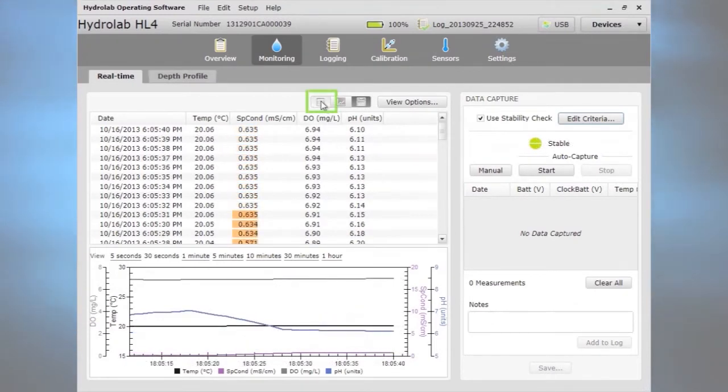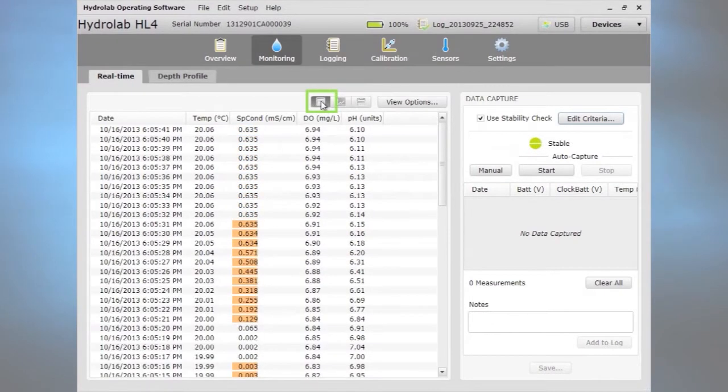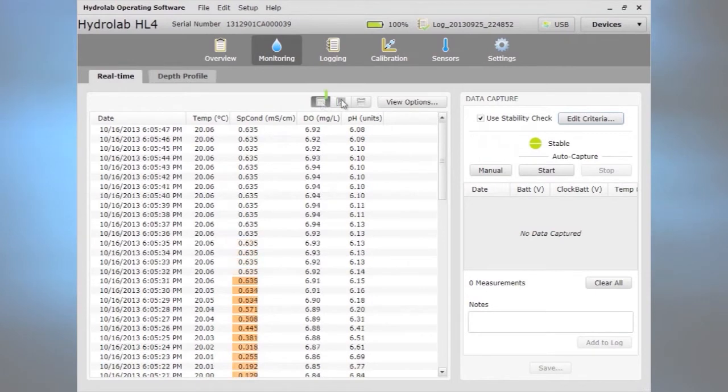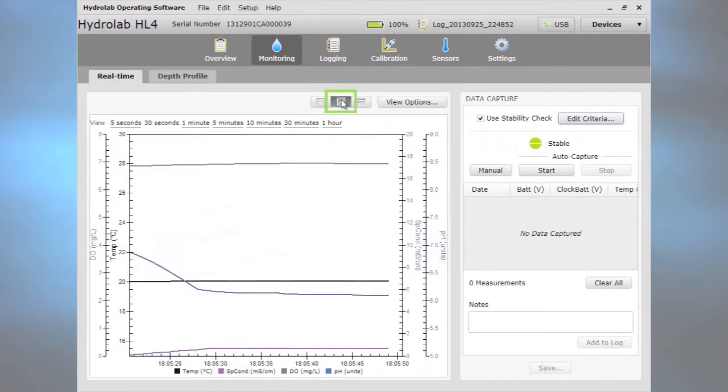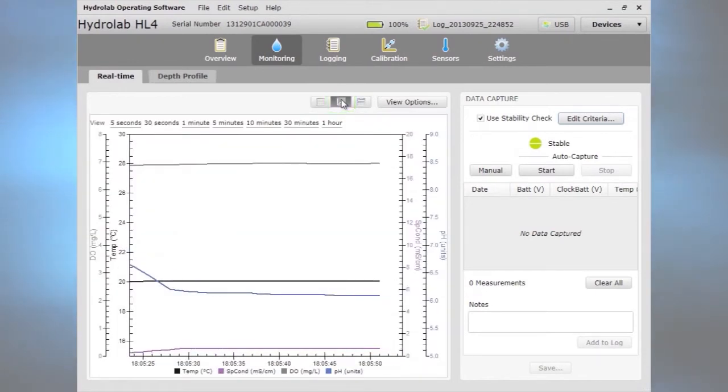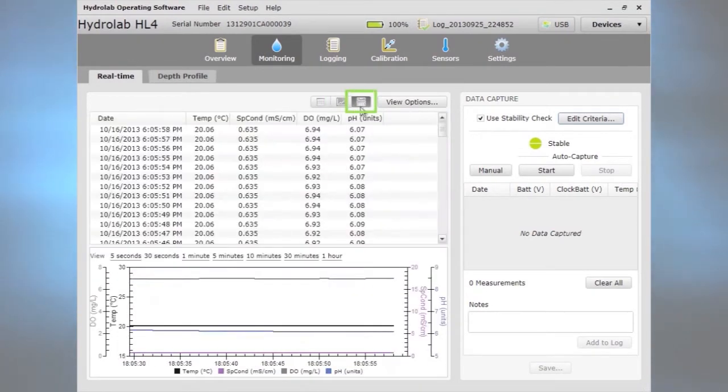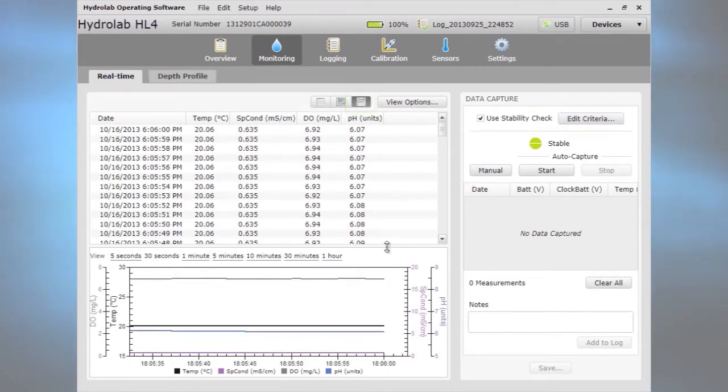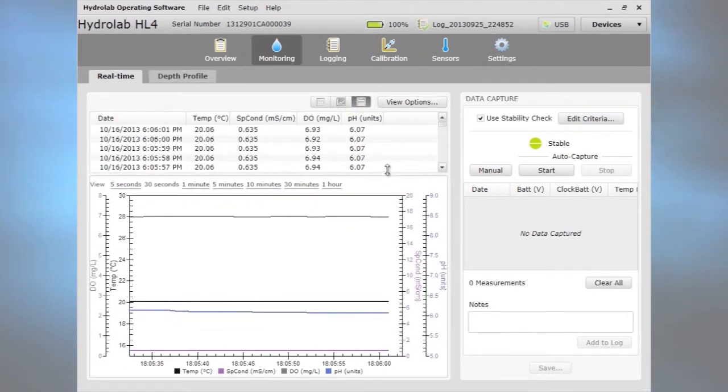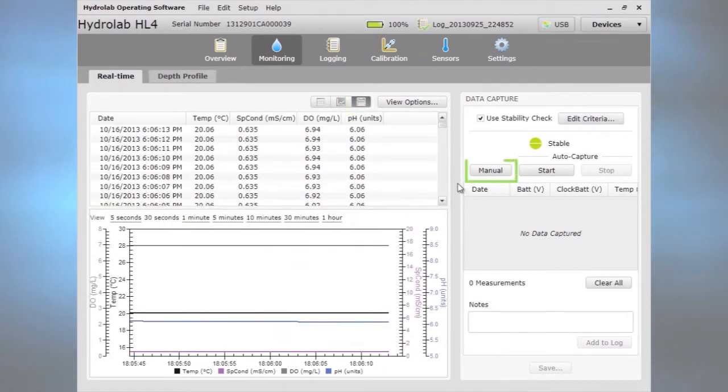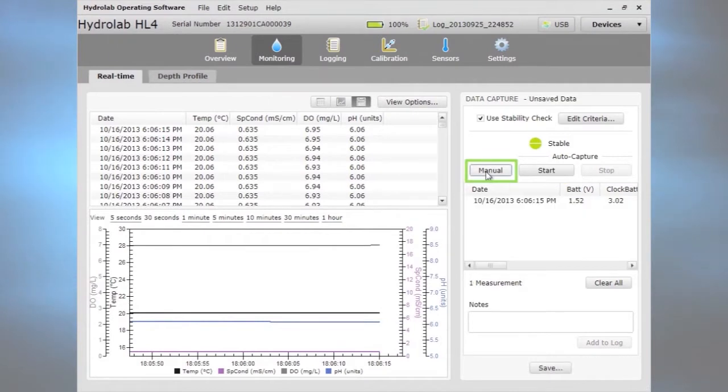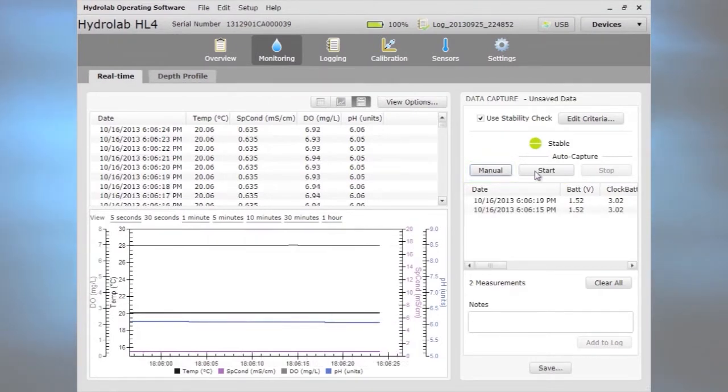Users can view data in table, graph, or mix both. When data are stable, collect data manually or continuously.